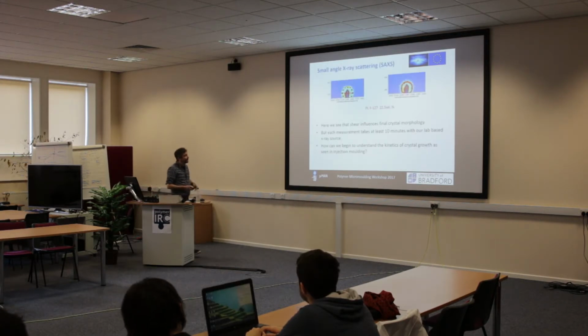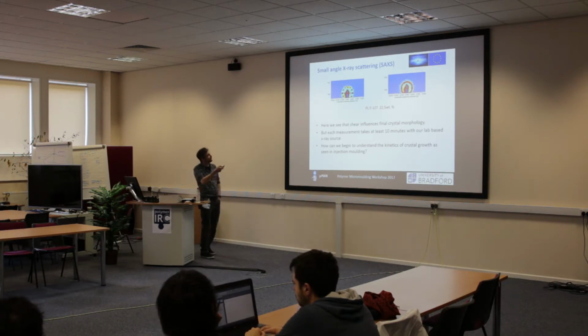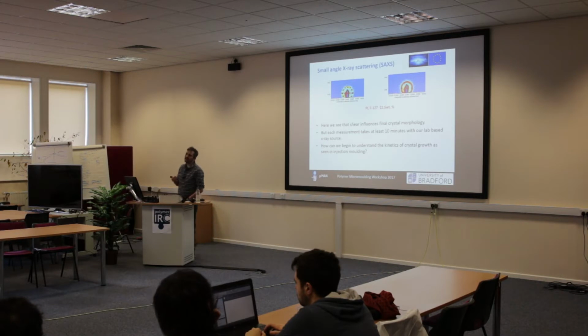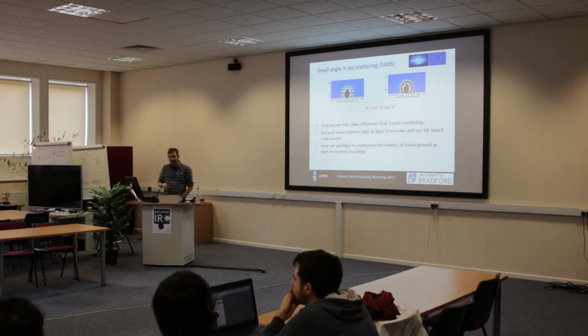And this is the effect of shear. This is using the same gel. This one is unsheared. This one is sheared. Sorry, I should have actually written that on. It's exactly the same material, and you see entirely different structures. What we're actually looking at here is micelles, which form at about 10 nanometer diameter. But they form in certain ways with the crystals that are nearby as well.